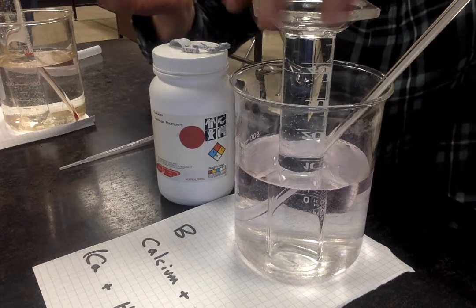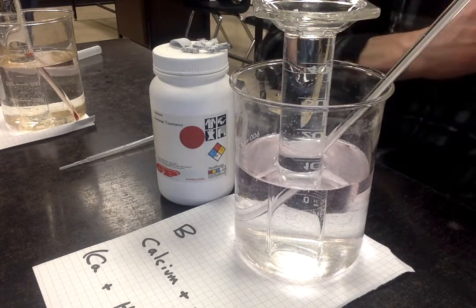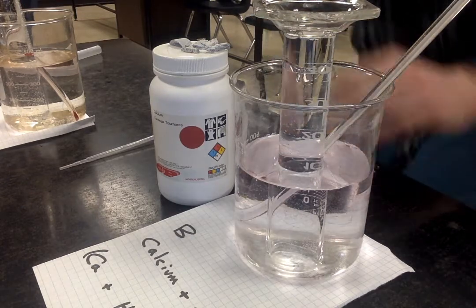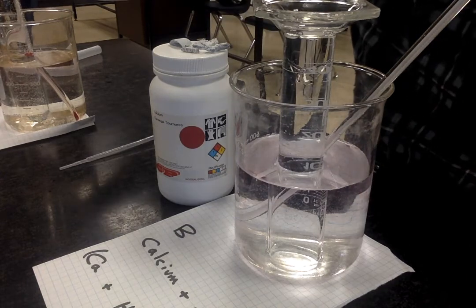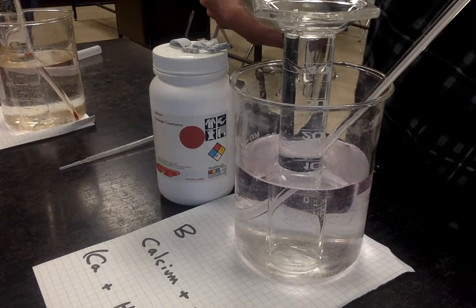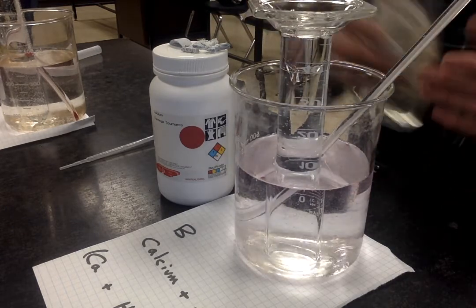I'm going to take this now and I'm going to actually, we have soap. We have soap, good. I'm going to do a bit of a variant on this experiment. I'm adding a squirt of soap to the zinc beaker and a squirt of soap to the calcium beaker.